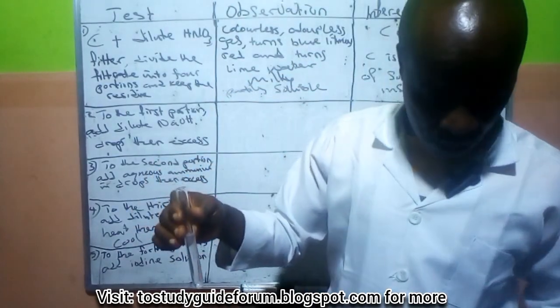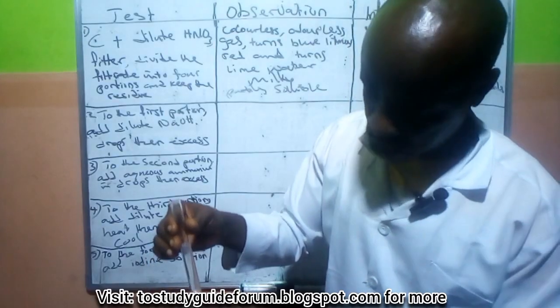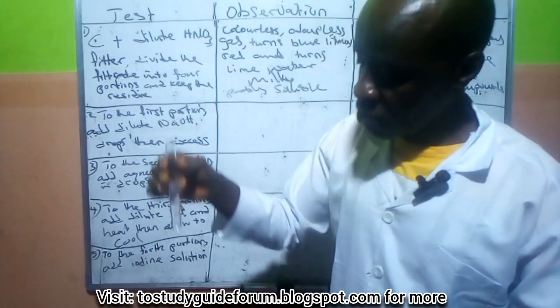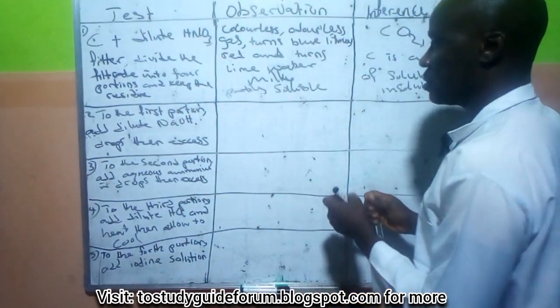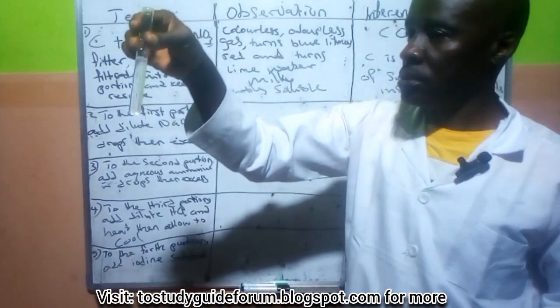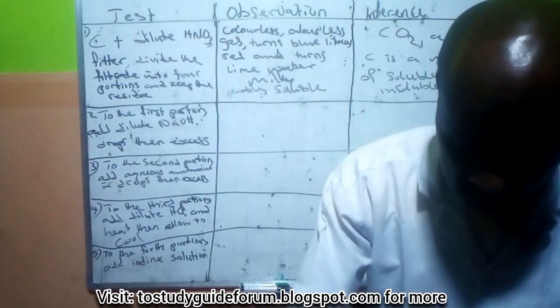Now it's soluble. It's soluble in excess. What do we do here? We come here and say what? As you can see, it's soluble, everything is a clear solution.